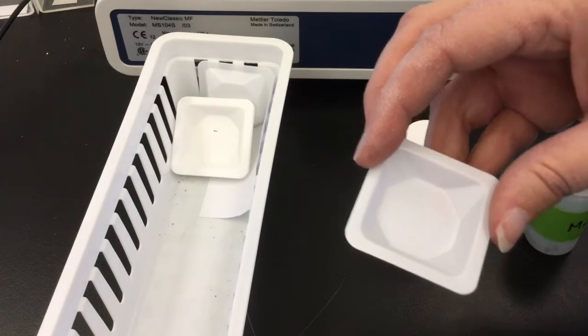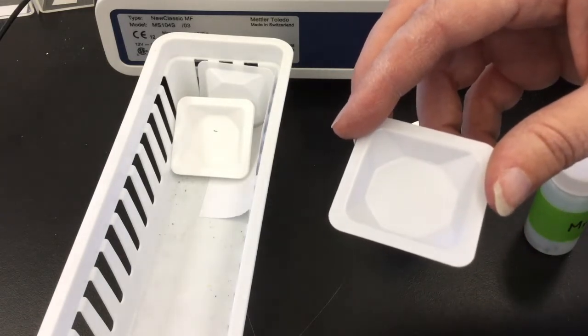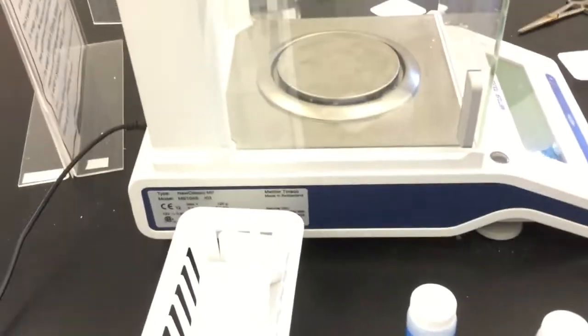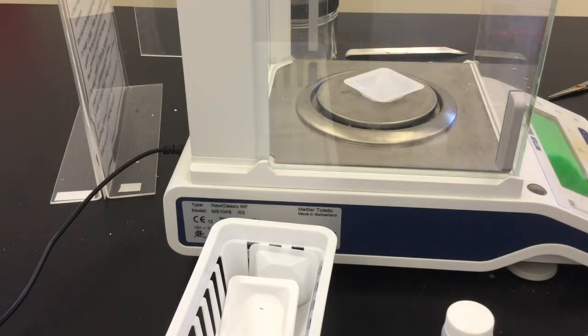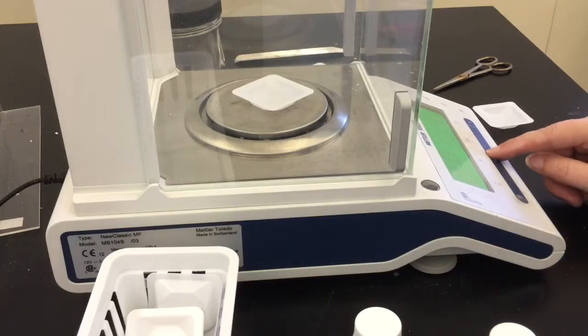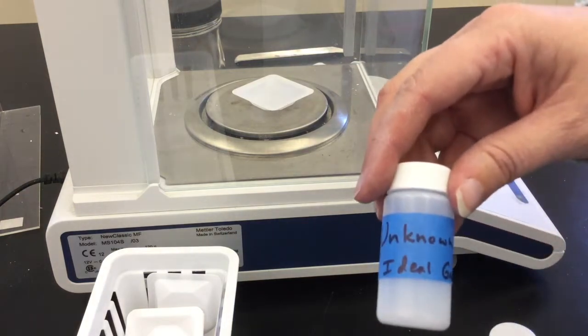You are going to be weighing out approximately 0.15 grams. Your instructor will give you the exact range that you should be using. Remember that you can weigh out using a weigh boat a couple of different ways. I could weigh the weigh boat and then weigh the material and subtract the difference. I am going to tare the balance so that it reads 0 grams, and then I am going to add a small amount of the unknown mixture.